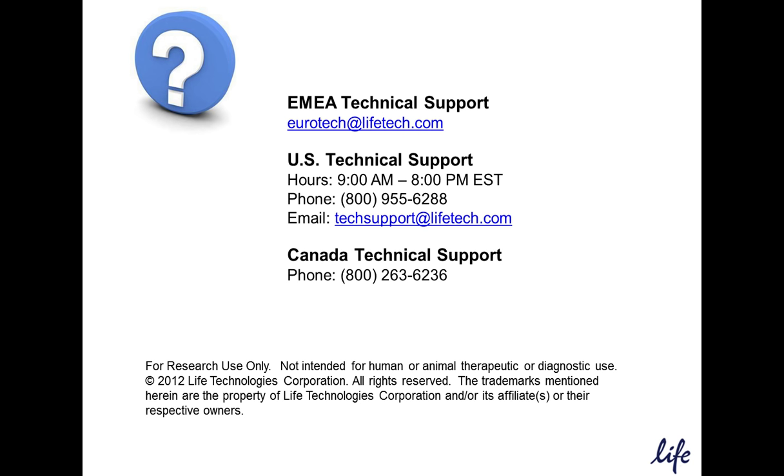So there's another question about using isotype controls and FMO controls together. So instead of using fluorescence minus one, you can use an isotype control in the FMO instead. And it's been my experience that that really has not been more helpful than just an FMO control by itself, and it just adds more cost and complexity to your experiment.